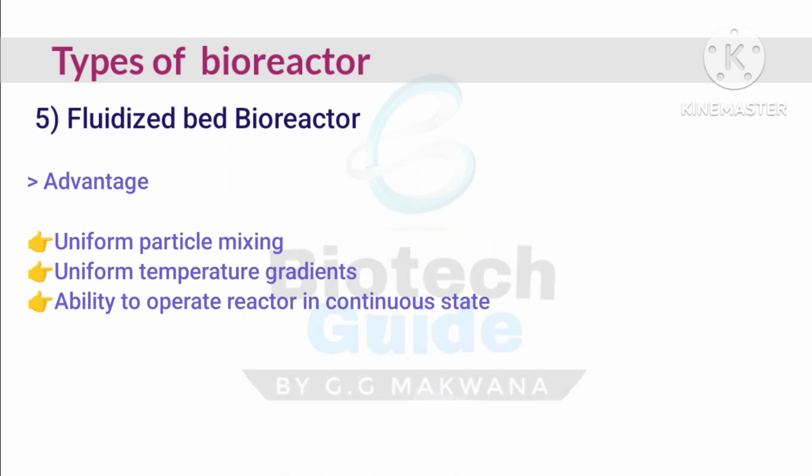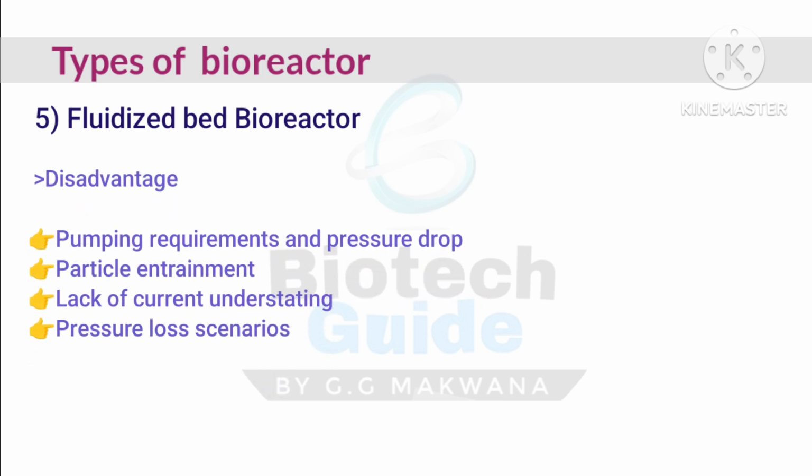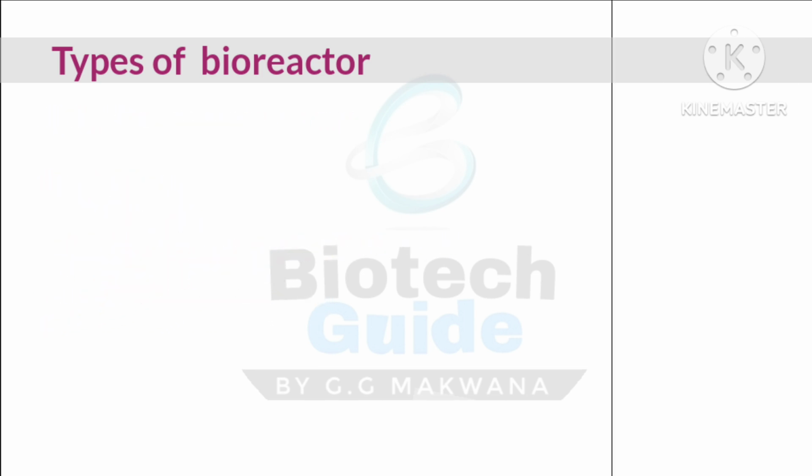Uniform particle mixing, uniform temperature gradients, and the ability to operate a reactor in a continuous state are the advantages, whereas pumping requirements and pressure drop, particle entrainment, lack of current understanding, and pressure loss scenarios are the disadvantages of this fluidized bed bioreactor.